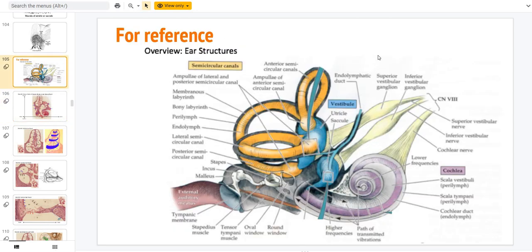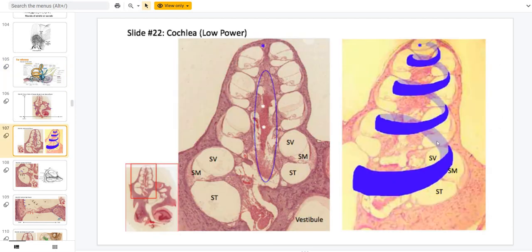The cochlea is a structure that spirals around itself. It starts off thicker at the base and as it proceeds through the spiral it gets thinner and thinner until you get to the apex. This slide really shows you that these cross sections of the cochlea are one continuous structure that spirals around itself. Along the longitudinal axis of the cochlea we have a structure called the modiolus — this is the thing that the cochlea is spiraling around.